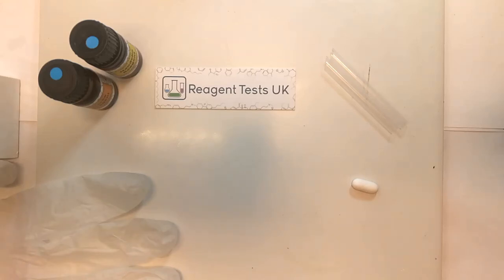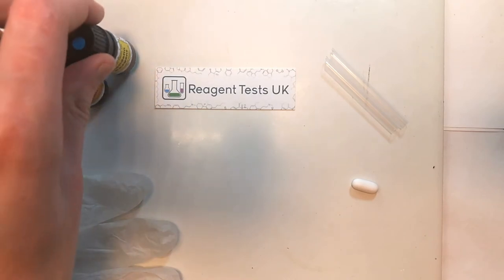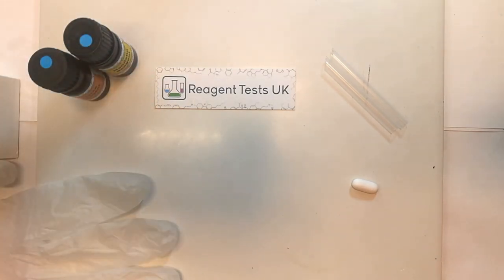In this video I'm going to explain how to set up to do a reagent test on a substance. You'll first need a reagent test — these are reactive chemicals that react when they come into contact with other things to produce a rapid colour change.